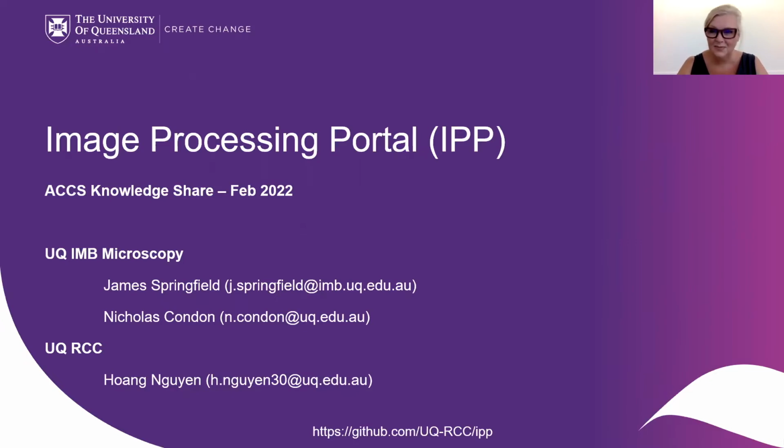Thanks, guys. Thanks, Catherine. Hi, everyone. I'm James Springfield, manager of the IMB Light Microscopy core here at UQ. Together with Nicholas Condon and Hoang Nguyen, we're going to be introducing the image processing portal that we've developed. Originally, the portal was designed to help our users, who are mainly wet lab biologists, connect to HPC and large-scale compute in a user-friendly way.